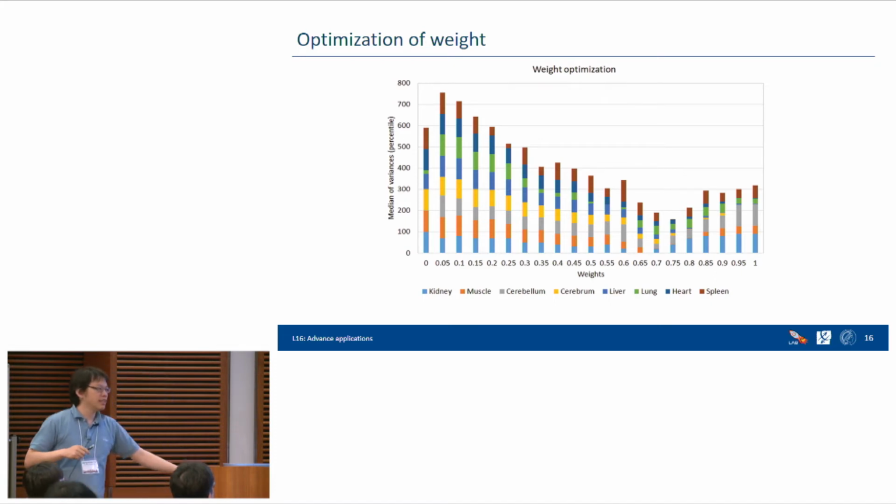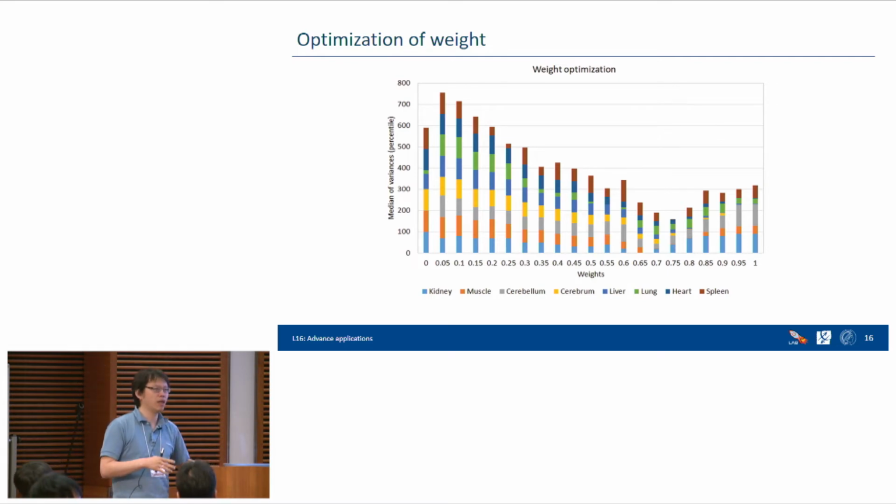The other one is PSM-level weighted ratio normalization. Currently, there are a lot of normalization methods, but most of them are based at the protein level. But we can imagine that the PTM works at the PSM level, so if there is a way to normalize peptides at the PSM level, that would be better, right? So basically, the idea is we ratio to the reference channel. If there are no reference channels, then we ratio to the total channel.